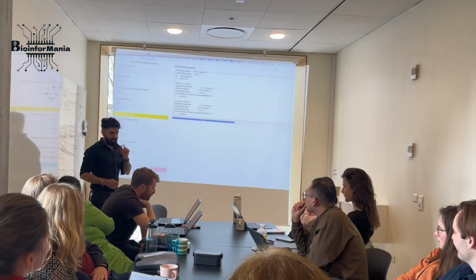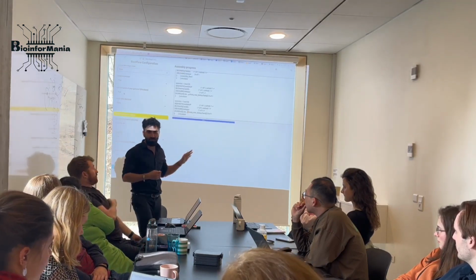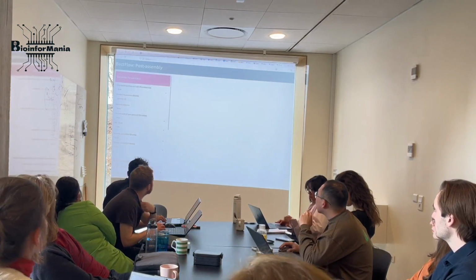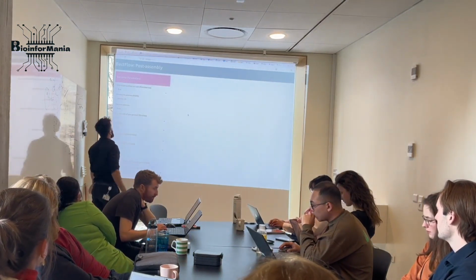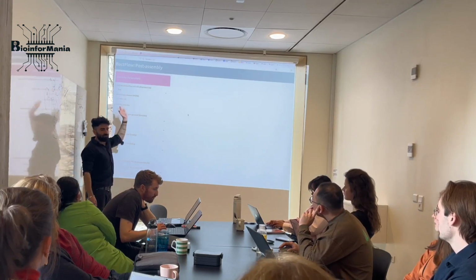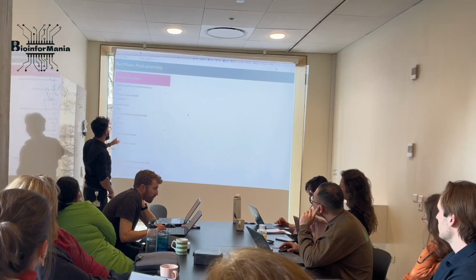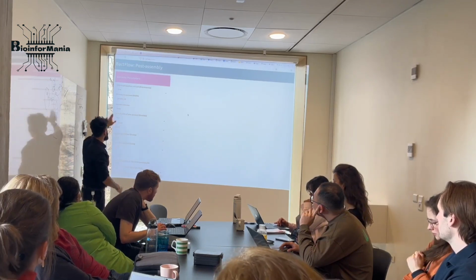Okay. While this is being assembled, I'm going to launch the other one, which is post-assembly, and I'll show you how to use that. This is the app for post-assembly. And in post-assembly, we have, again, only install. And you don't need to be worried in the container, okay? That's made for people who want to do it on their own computer. And I'll tell you how to download it. It's on my GitHub. Just download the whole repository and then you can use it.